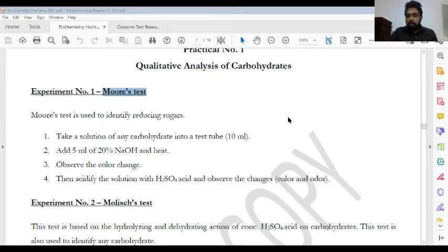They can form colored compounds with alpha naphthol, but I'm not sure that the result is similar to the purple coloring that is given by hexoses and pentoses, for example glucose, fructose, galactose-like sugars. The result may be a little bit different from that of hexoses and pentoses.